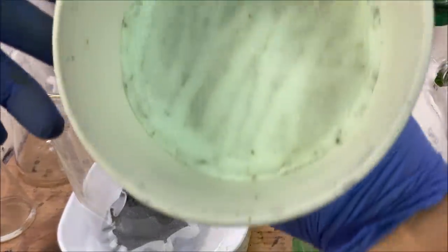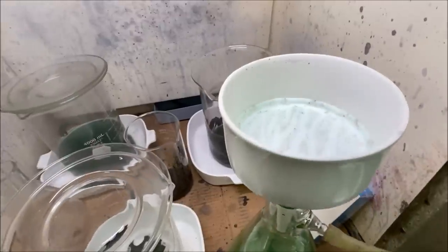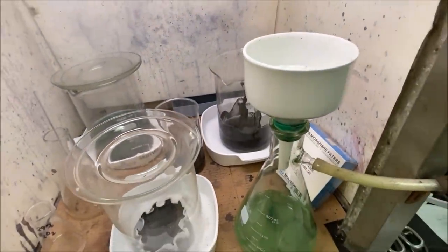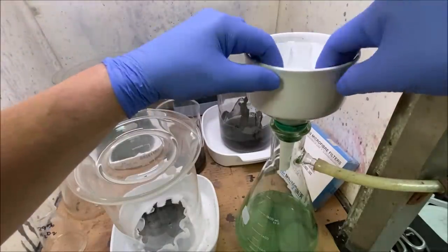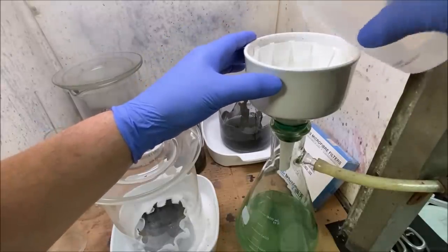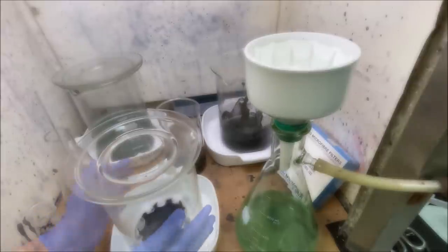Bang, just like that. There's our microfiber filter. Okay, now that we've got our solids removed from this funnel, I've got a little bit of room up here. I'm going to install another paper funnel. I'm going to leave the microfiber filter right in there to provide a base in case that sulfuric acid tries to eat that paper. I'm going to move this out of the way now.